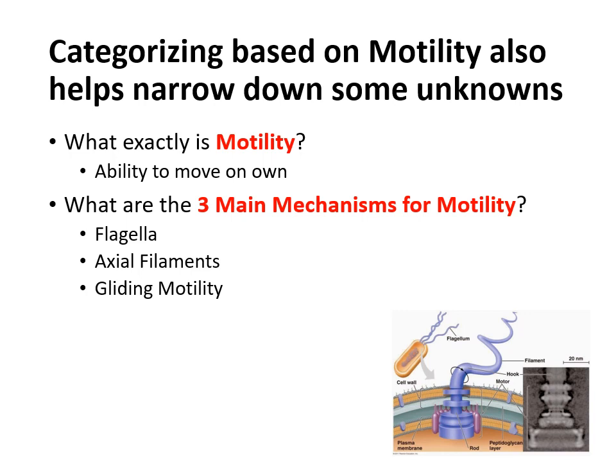Now, in addition to the Enteropluri test, I also want to introduce in this lab motility, because characterizing motility of an unknown bacteria can really help you narrow down which bacteria that can be. So first off, you should be able to answer, what exactly is motility? Well, that's the ability for a bacteria or any organism to move on its own.